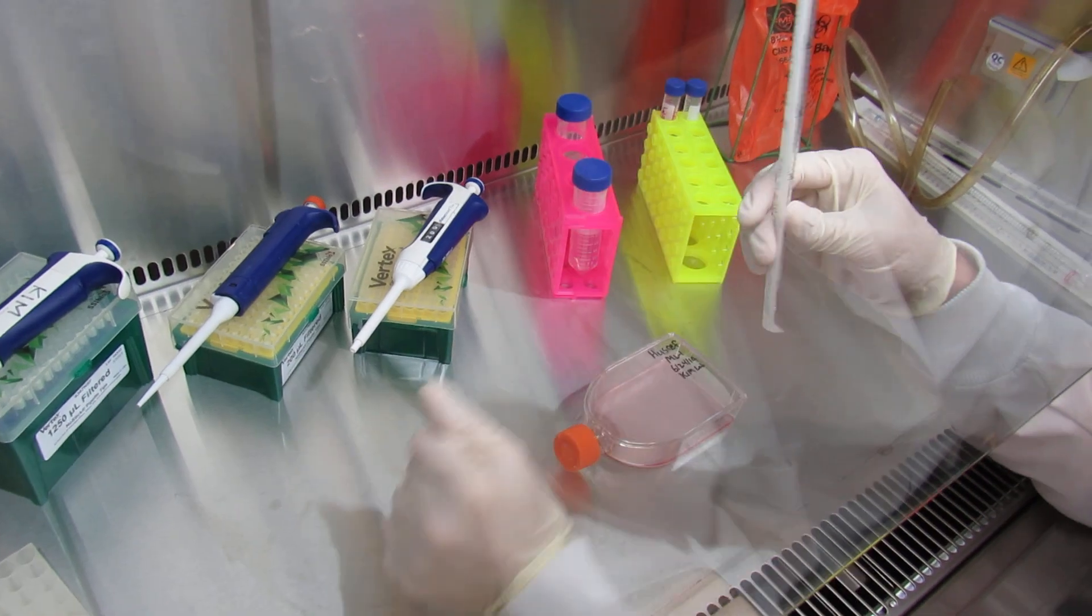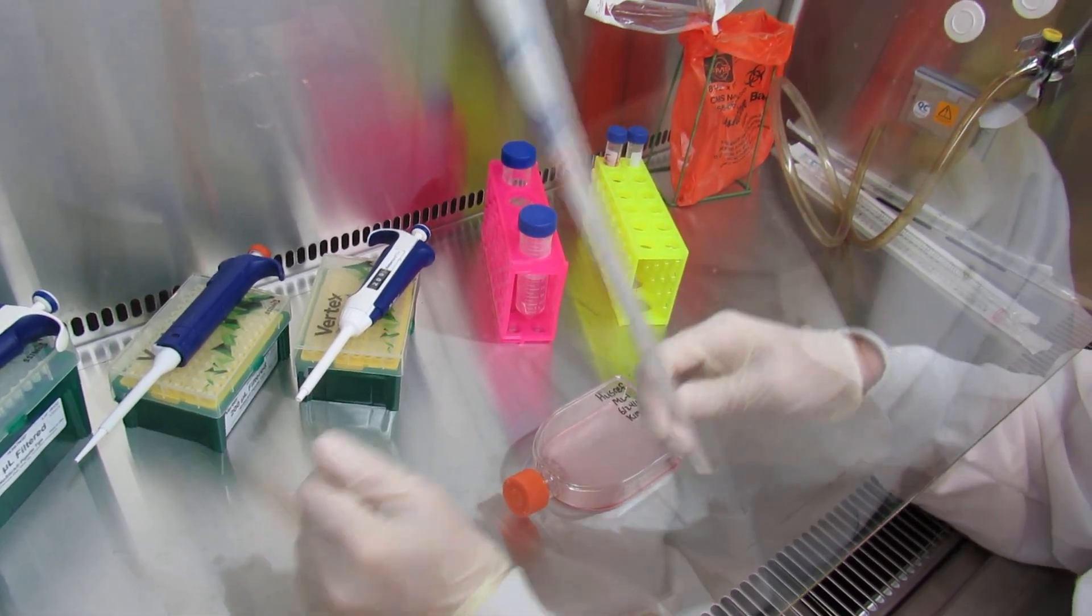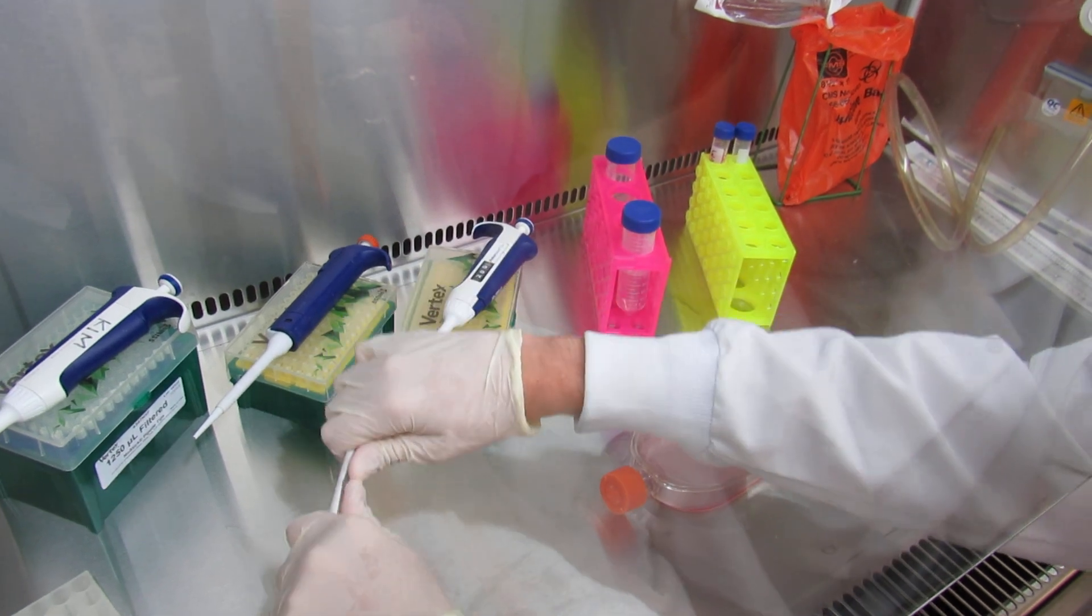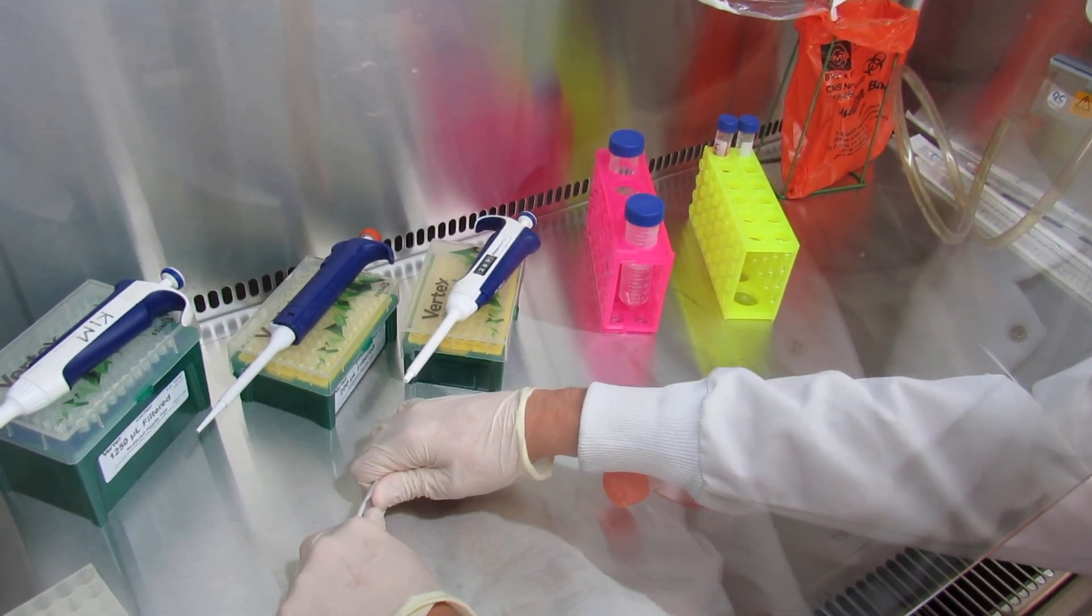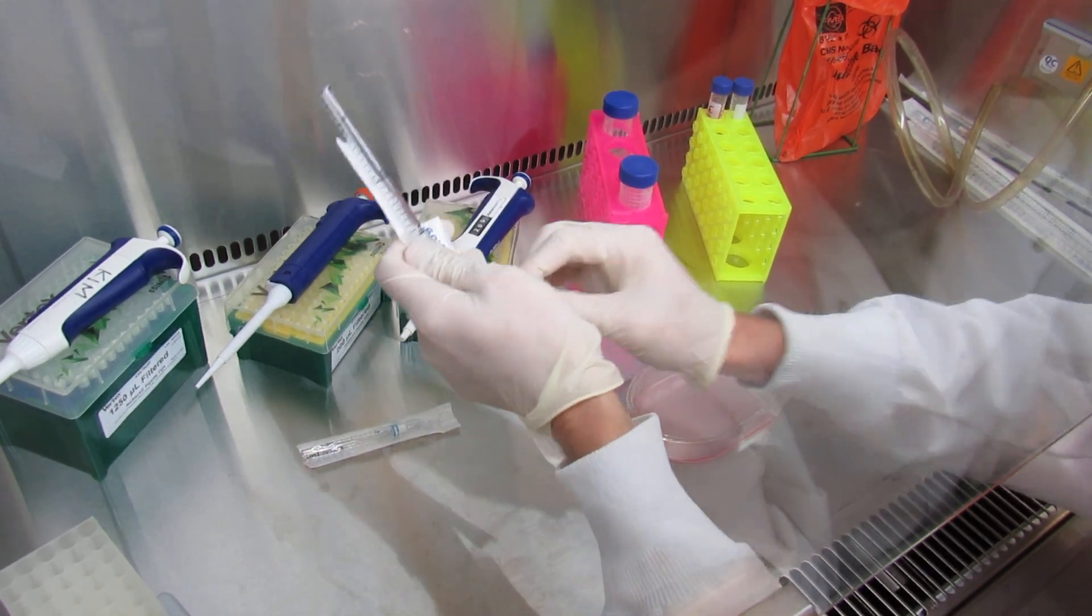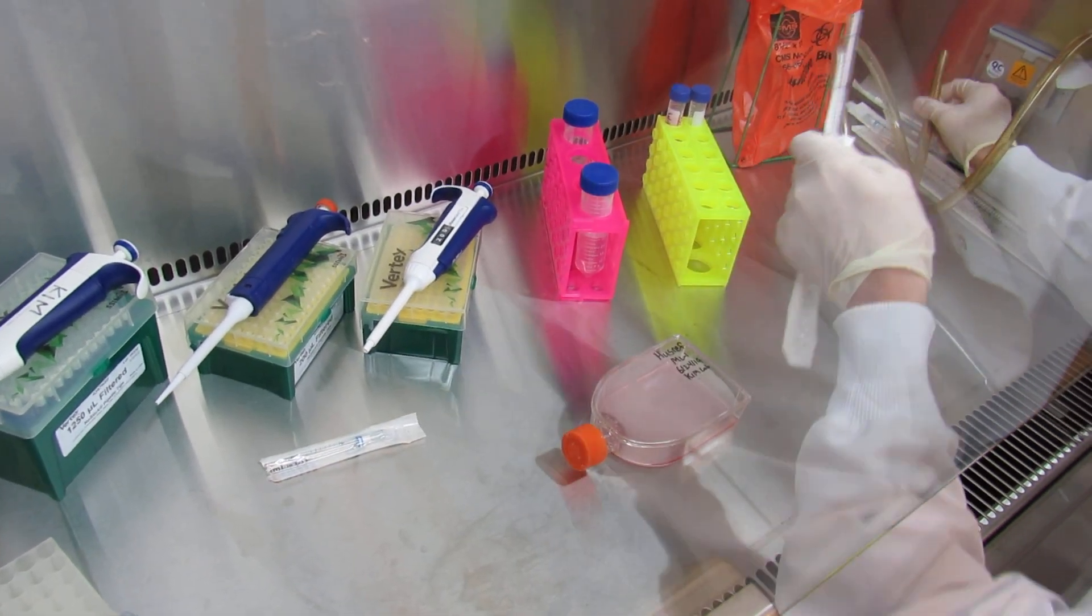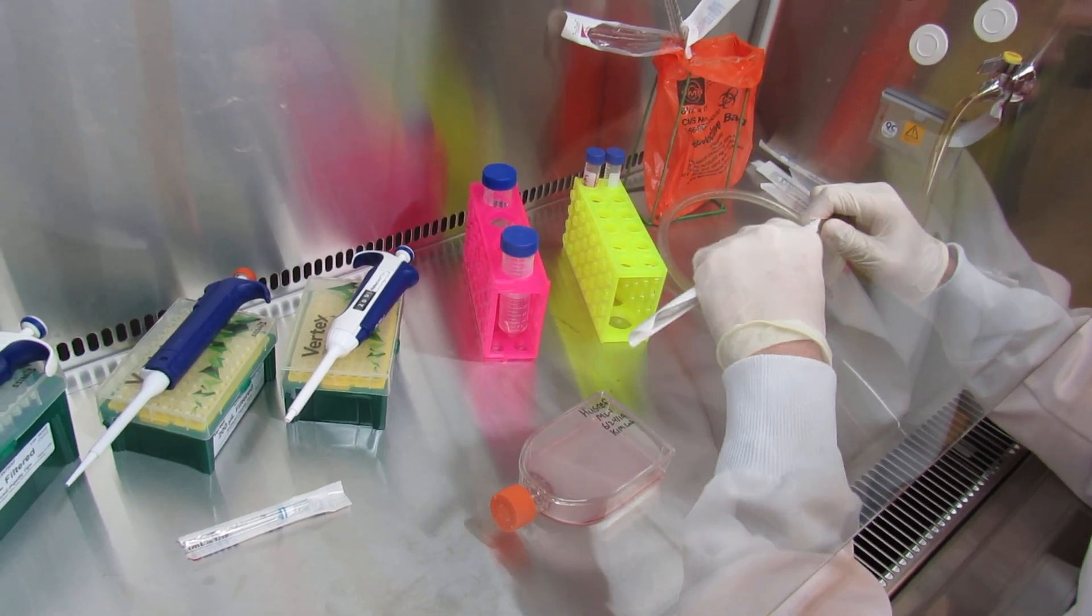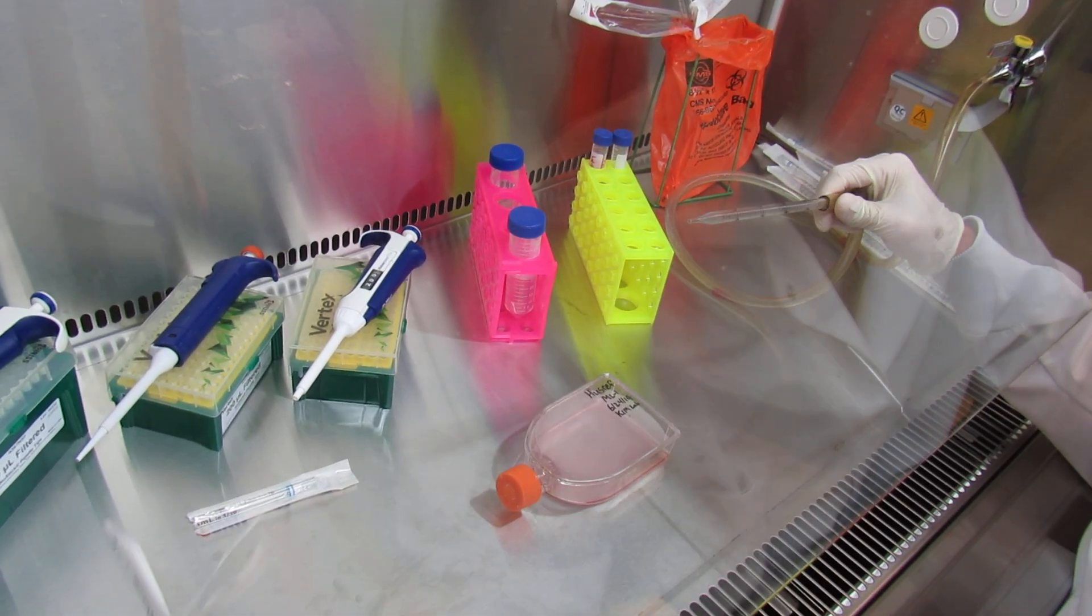Next, to use the vacuum, you'll take a 5 milliliter serological pipette tip, and you're going to snap it around here at the minus 2. Snap it in the corner, being mindful not to spray it towards yourself, and peel it back. You'll then take your vacuum hose and insert the end of the tip there.